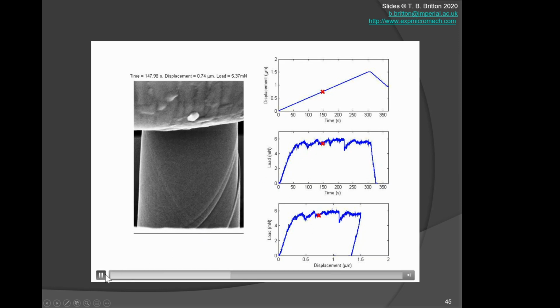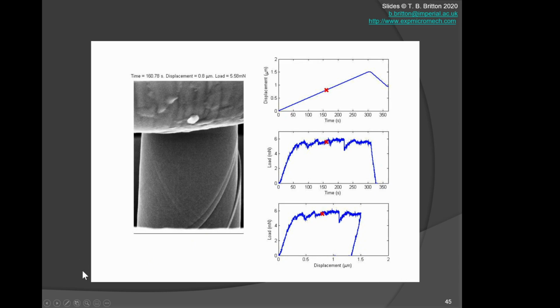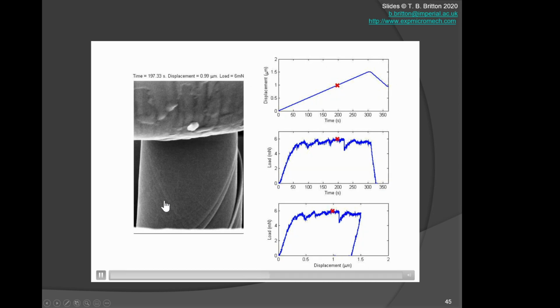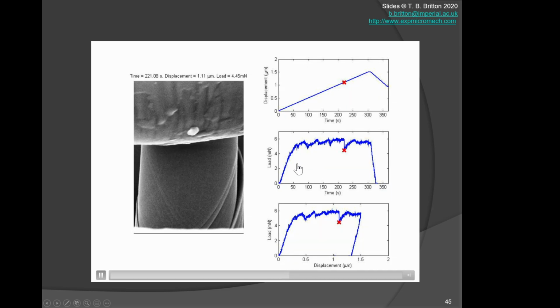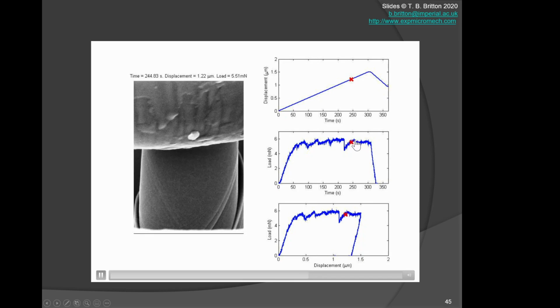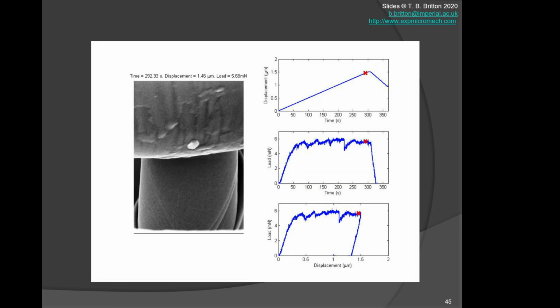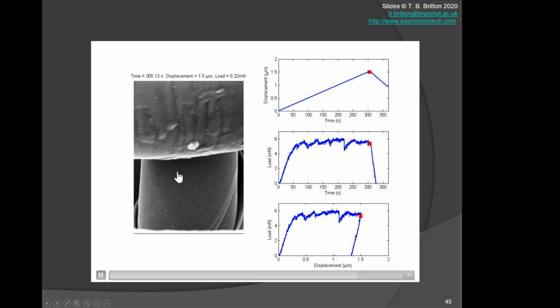this object. And this enables me to tell stories, but the specific region here that's really clever is that I managed to optimize the contrast of my scanning electron micrograph, so that this is running at a relatively fast frame rate, and I can characterize what's happening against my actuation. Even if you're not running in situ, this means I can grab the data as quickly as possible, which means I can either shorten the amount of time I'm spending on the microscope or look at more samples, both of which are valuable in these problems.